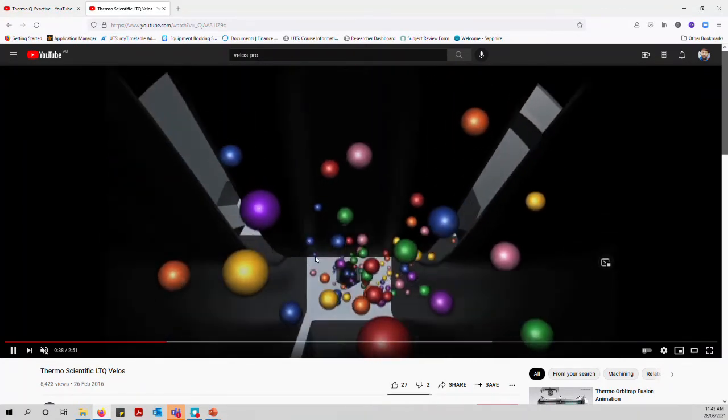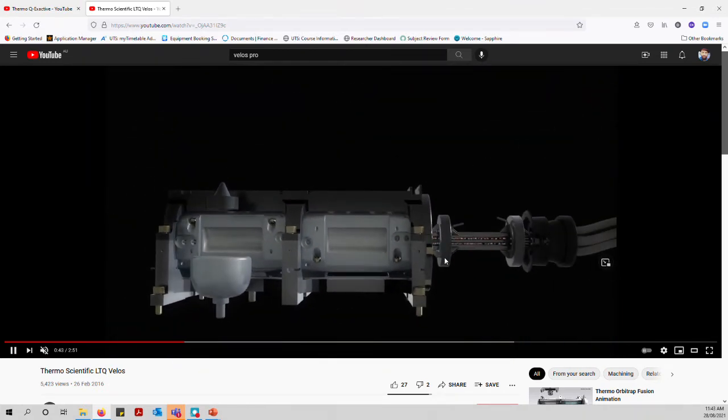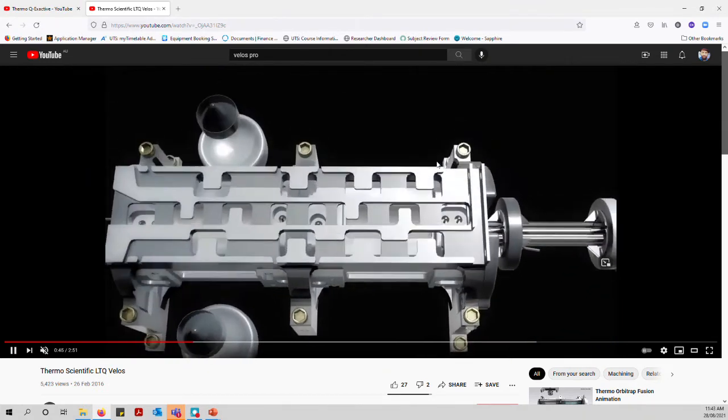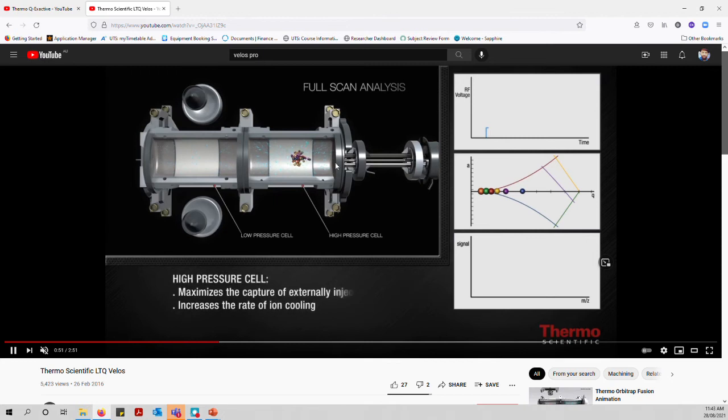So you can see this S-bend that the molecules have to go through, and they can only get through there if they're charged. You then have these ion gates where a packet of ions can be held within the trap, but any ions that are coming in can get stopped from coming in. And this happens on very, very short time frames.